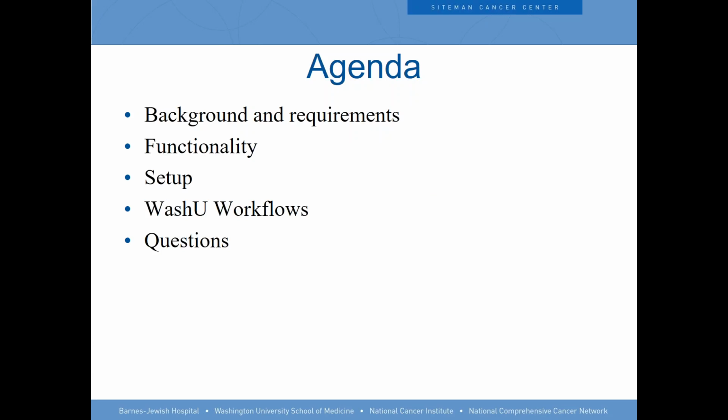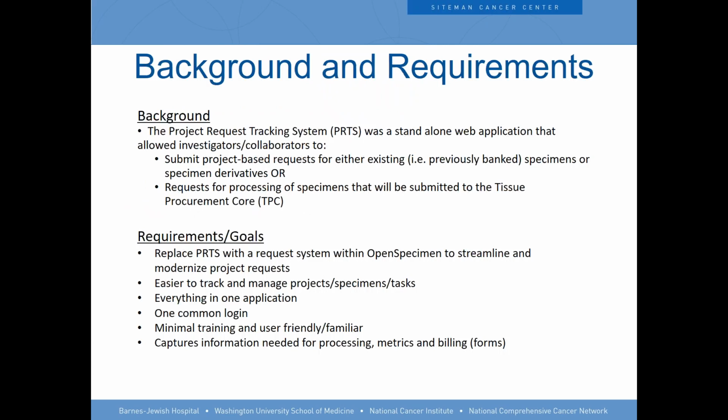Okay, yeah. So the agenda isn't long for this, and it's really just meant to be a brief introduction on why we did this, what use it has for our tissue procurement core, and how to utilize it, and then just follow up with any questions at the end.